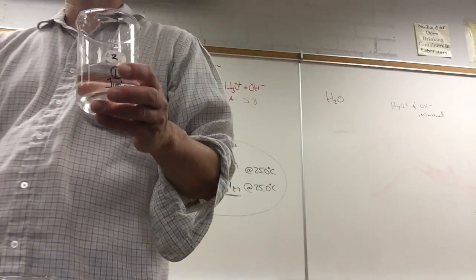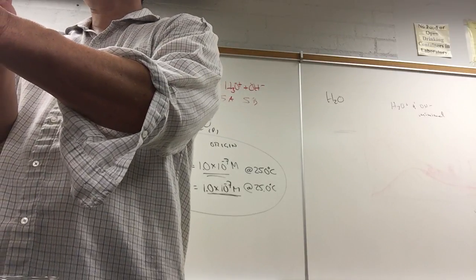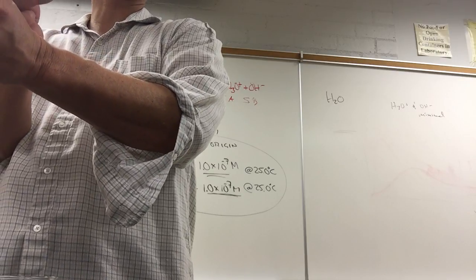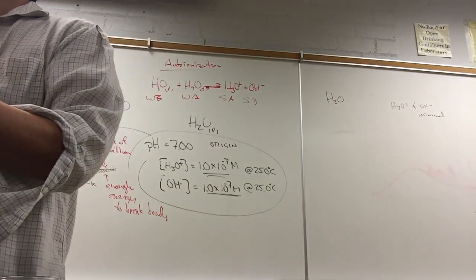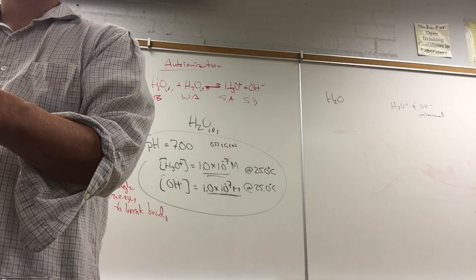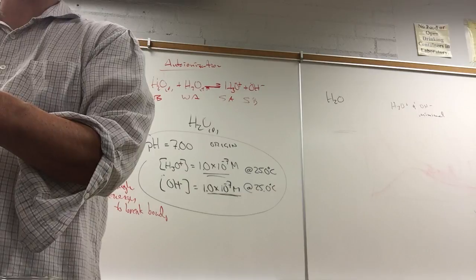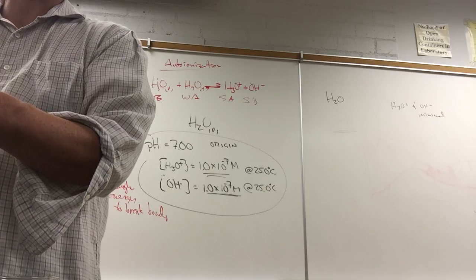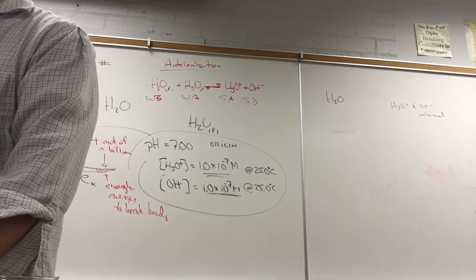this is salt water too, right? This is salt water, but what happened to the bulb? Now it looks like tap water because I diluted it. Even though we call sodium chloride a strong electrolyte, it might not conduct electricity at all depending on its concentration. This is why we always think in terms of 2 definitions. Just because we have salt water doesn't mean it's going to be a good conductor of electricity. It should be at high enough concentration. Okay, all right, what's next?